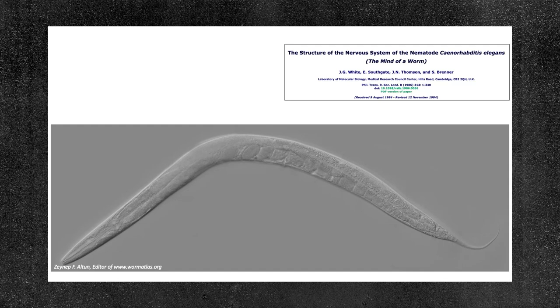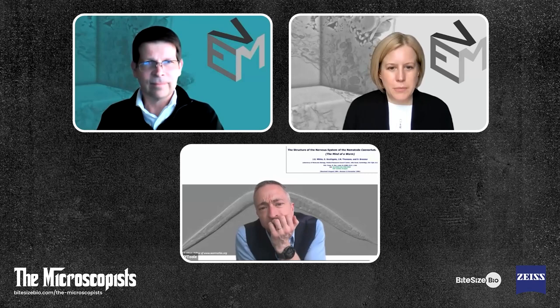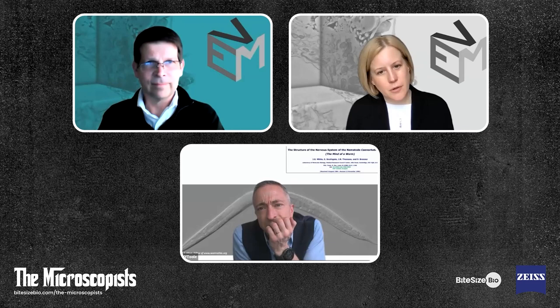Well, for me, it started back with the worm. A very small organism called C. elegans. Don't try and spell it. Back when I was at the LMCB in London, I was collaborating with a group who wanted to do electron microscopy on the worm. And you need volume. Normally back then you were talking about imaging 2D planes in a transmission EM, but to go through something like the worm, you need to start moving into volume.